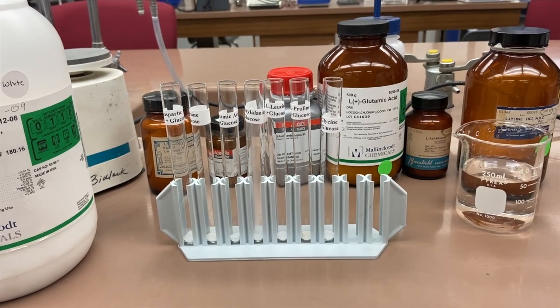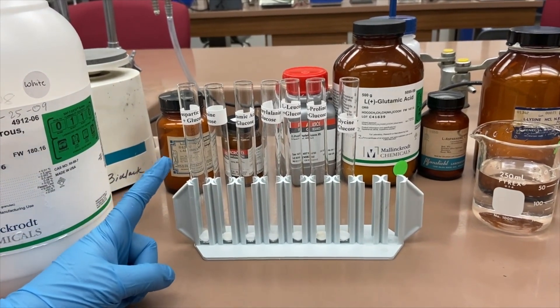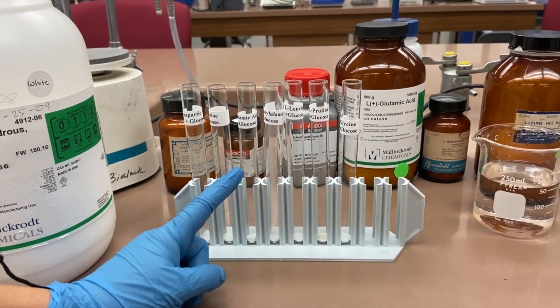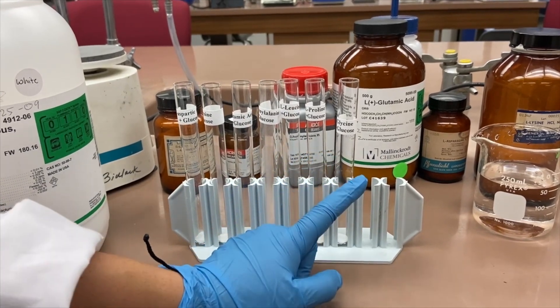To begin the Maillard reaction between amino acids and glucose, I added 0.1 grams of glucose into each amino acid tube. I have aspartic acid, lysine, glutamic acid, phenylalanine, leucine, proline, and glycine.